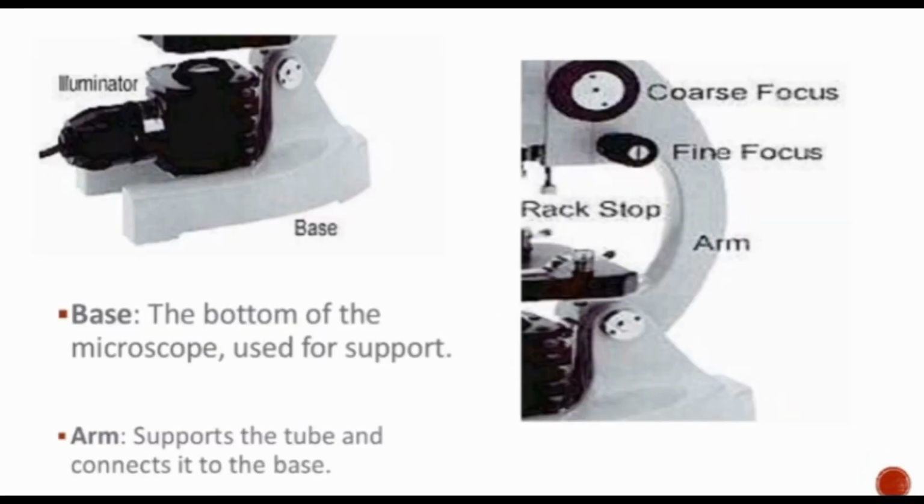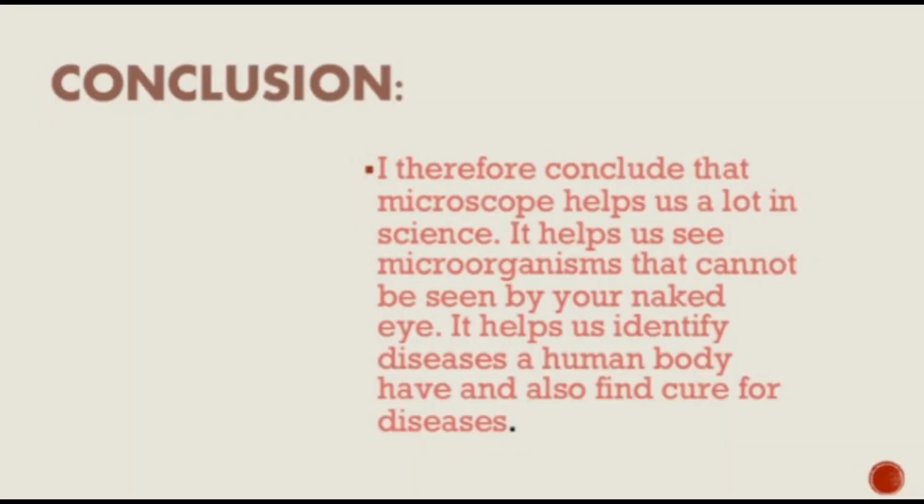And we have the base and the arm. The base is the bottom of the microscope used for support, and the arm supports the tube and connects it to the base.